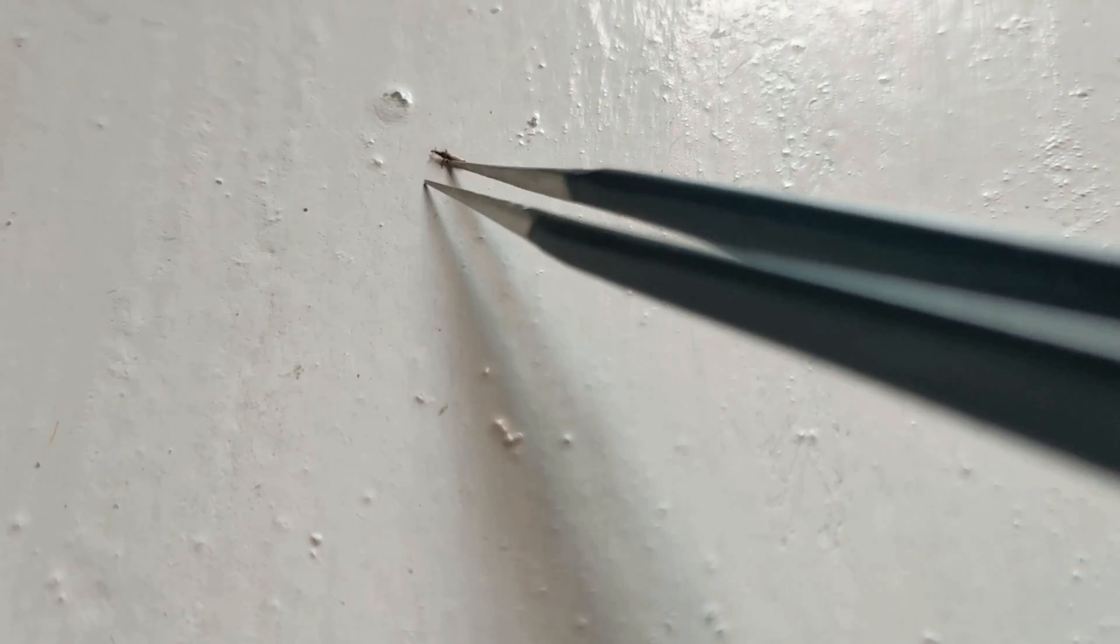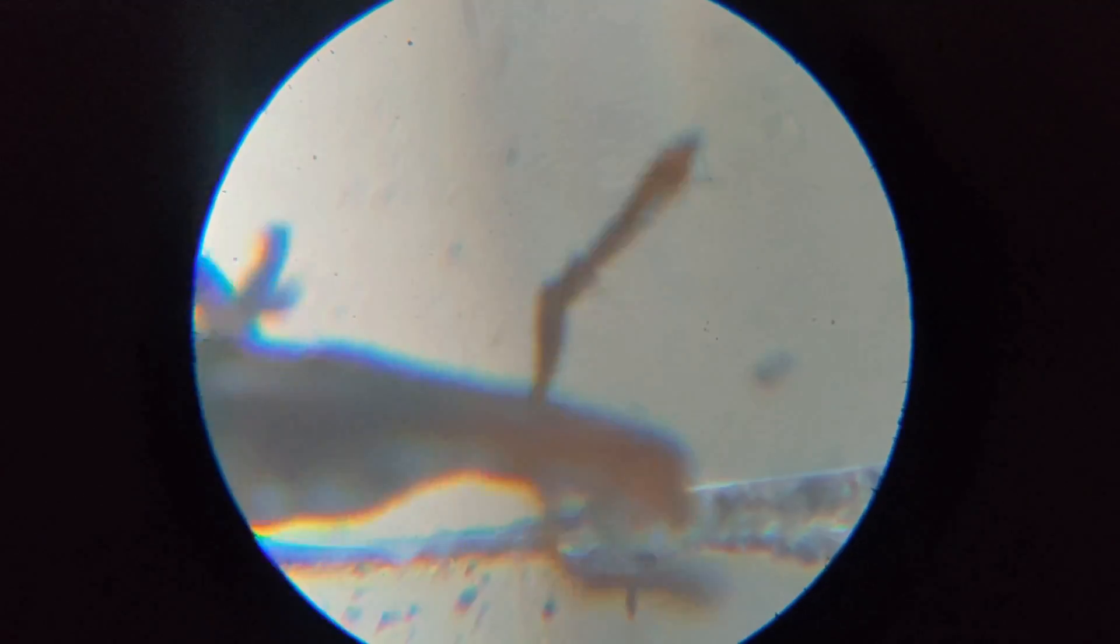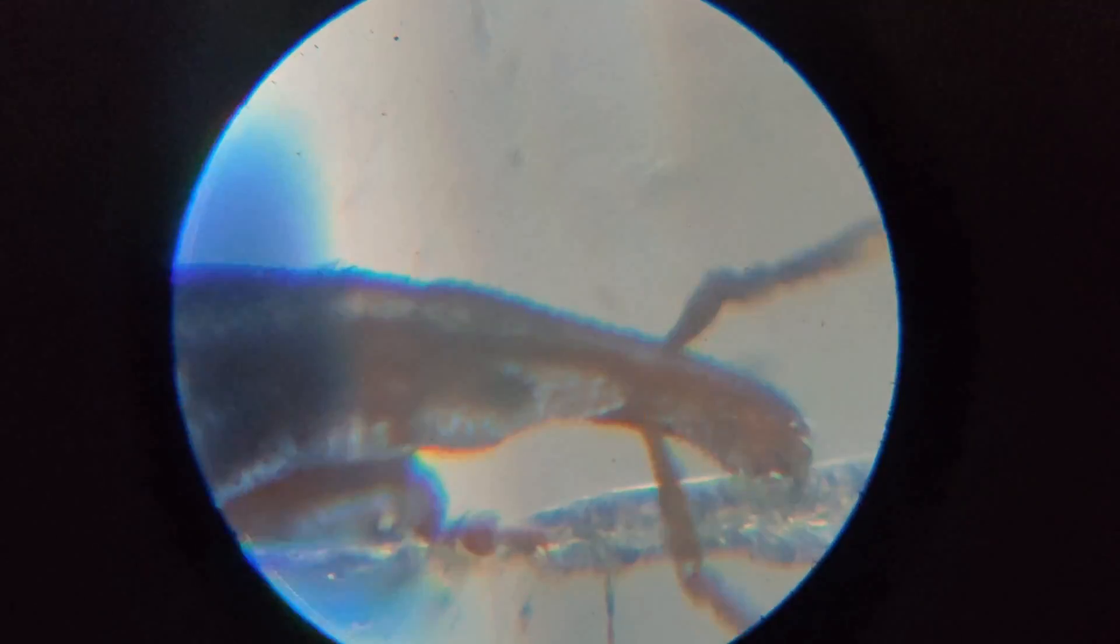I tried without a water drop and see what happened - it is escaping from the cover slip. Moving things are very hard to focus and gone. These rocks are tiny grains of salt.